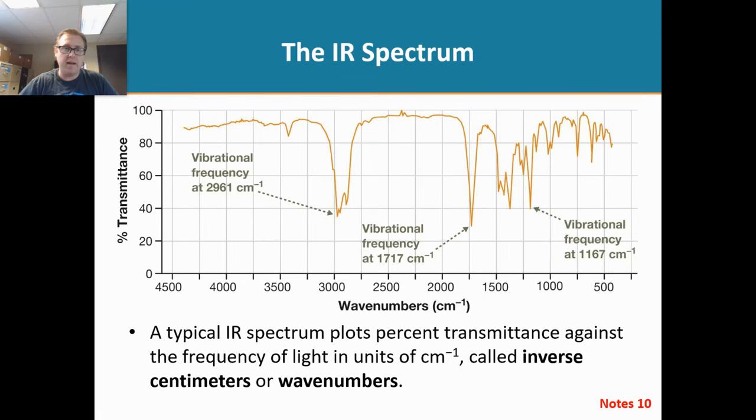On this slide is an IR spectrum. What we want to talk about is the y and the x-axis and understand what this orange line, all these scribbles really, means. Believe it or not, all this information right here helps chemists determine the structure of molecules. It's going to be so cool once you've learned how to interpret what this is actually saying. It's pretty neat.